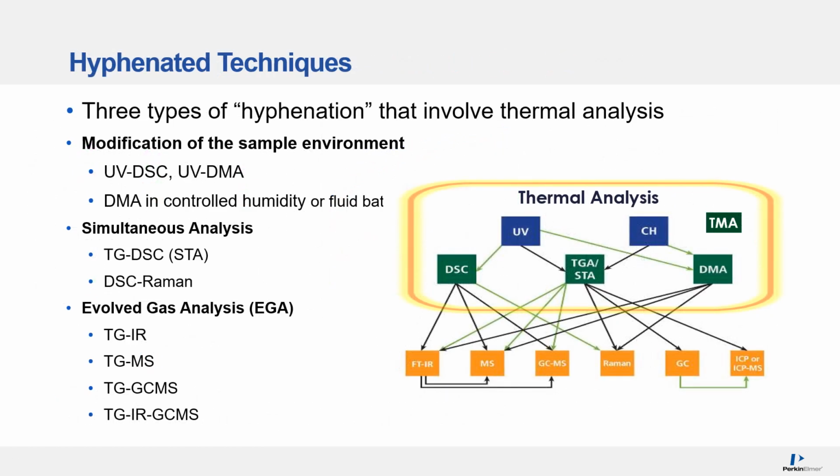So now let's switch gears from applications to what you can get out of using hyphenated techniques. We've already discussed a few hyphenated techniques, but let me go into this a little bit further. Coupling or hyphenating two or more analytical instruments can give us the advantage to detect and separate chemical aspects of interest with higher sensitivity and selectivity. It can uncover results and insight not possible with just using an individual technique like DSC or TGA.